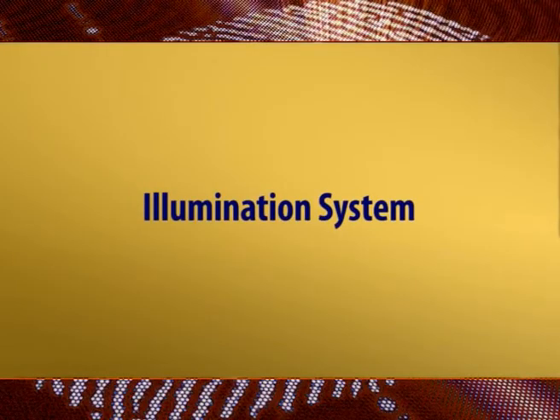Now, the components of the transmission electron microscope imaging system are the illumination system. The illumination system comprises an electron source, a thermionic gun which emits a monochromatic beam of electrons. This beam of electrons possesses kinetic energy high enough to traverse the thin areas of the specimen. The electron source inside the gun is a pointed hairpin shaped tungsten filament or a spike shaped lanthanum hexaboride source housed in an electron accelerating chamber.